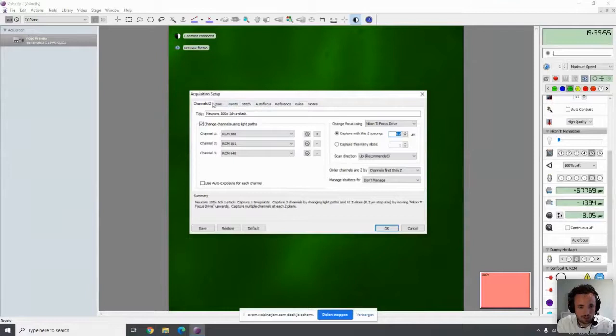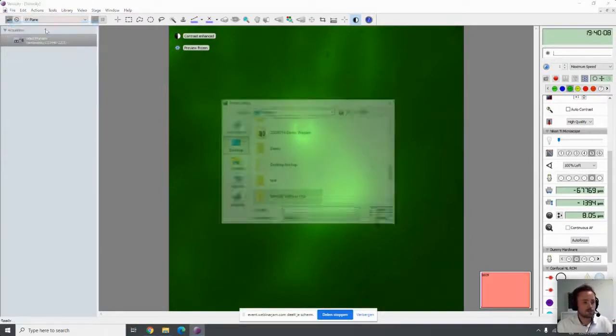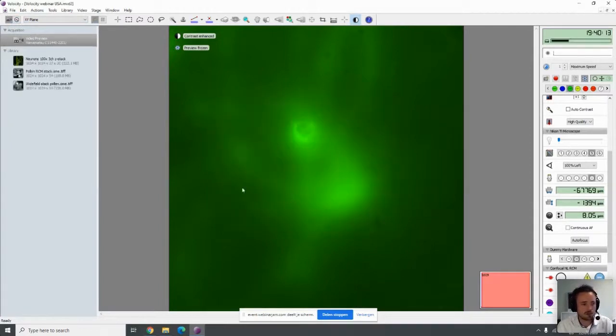Jeff covered all these points. So here you can do time experiments, points, and stitching as well. But for now, we want to make a Z stack of this cell. So I can hit OK. I have to open a library as well. So this is where the images will be stored. I already made one here. So meanwhile, while it's imaging, I can show you some images we already obtained before. So I now just switch the unit back into RCM mode, and I'm ready to run my protocol.